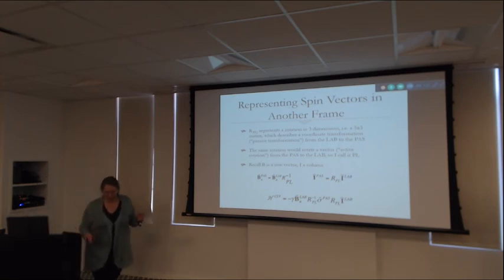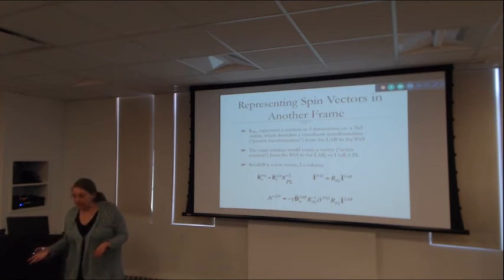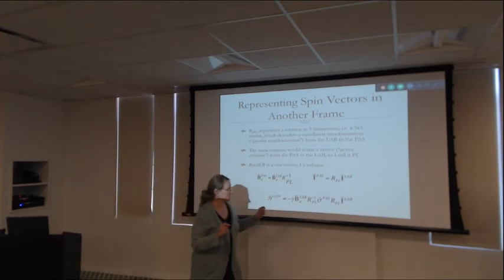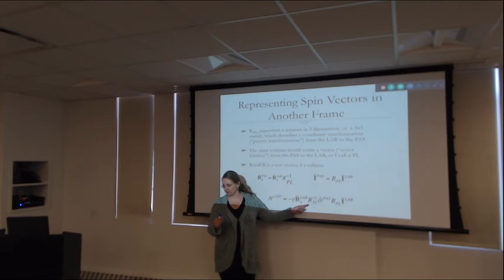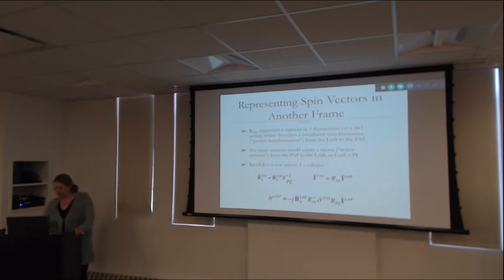I mean, it's true that if something changed in your experiment, like a chemical reaction went on, or a conformational exchange that had a big effect on interactions, maybe the chemical shift values would change. It's true. But most of the time, we think that changes in the sample, like magic angle spinning, conformational exchange, what they're doing in terms of this equation is they're changing the value of R. That's what the time dependence is. It's in R. Most of it.